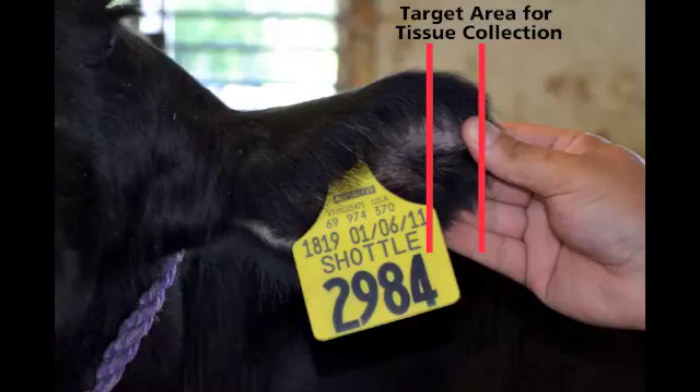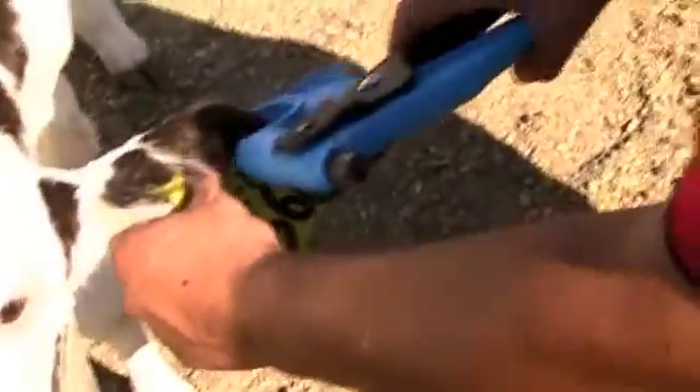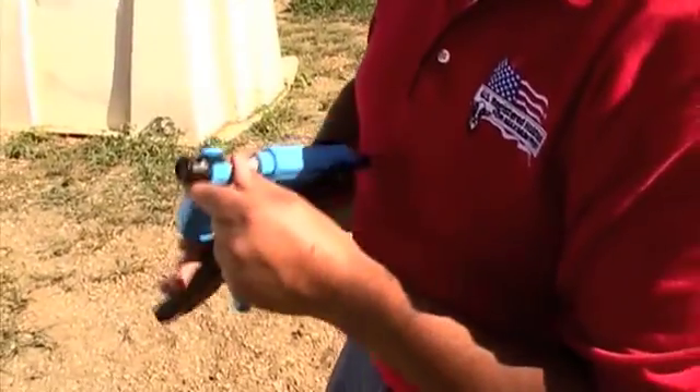Before taking the sample, identify the target area of the ear. Focus on the section of the ear approximately one inch from the tip, away from any major blood vessels, ribs, and any ear tags that may be present. A quick rub of the ear between your fingers will confirm that the spot is clean and clear. Place the applicator over the ear and close to the target area. In a swift, fluid motion, squeeze the handles together, taking care to move with the animal if it moves.